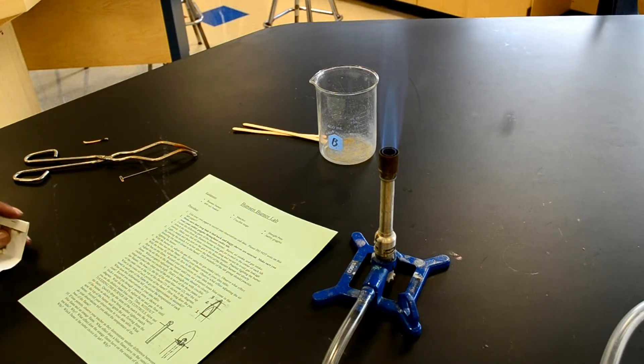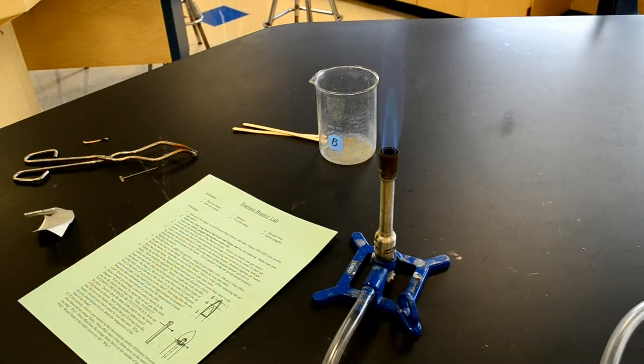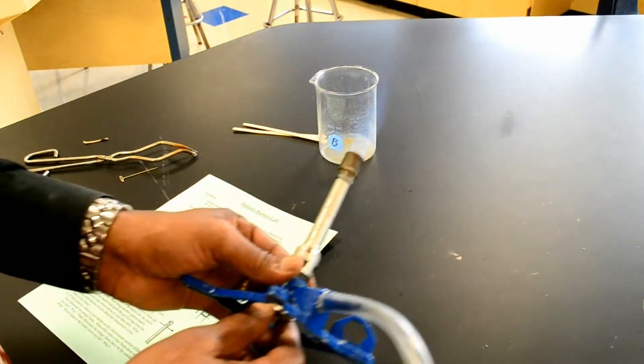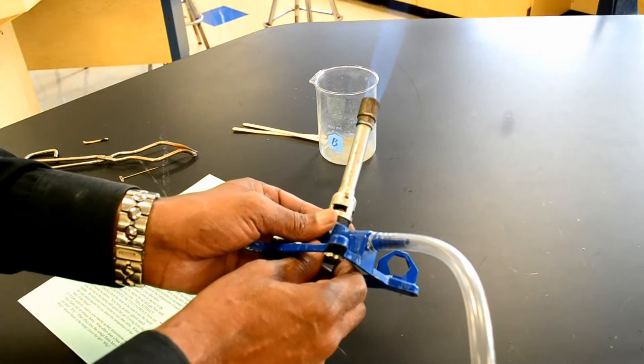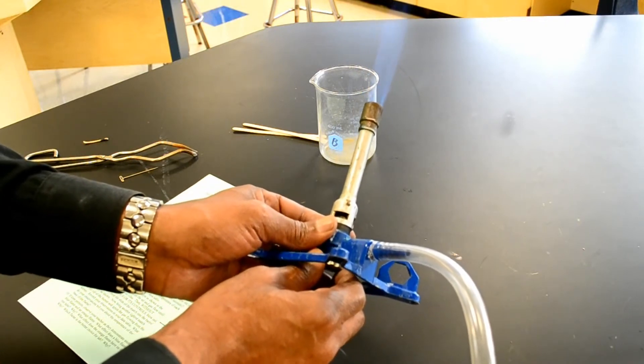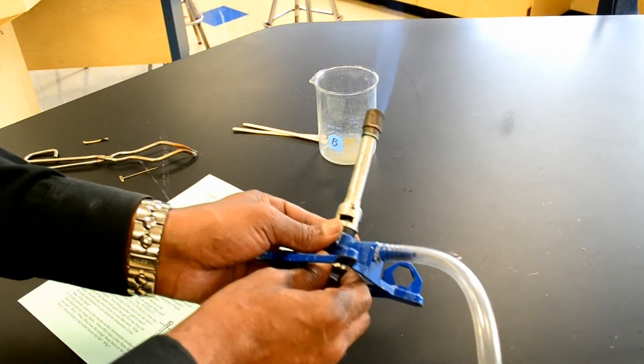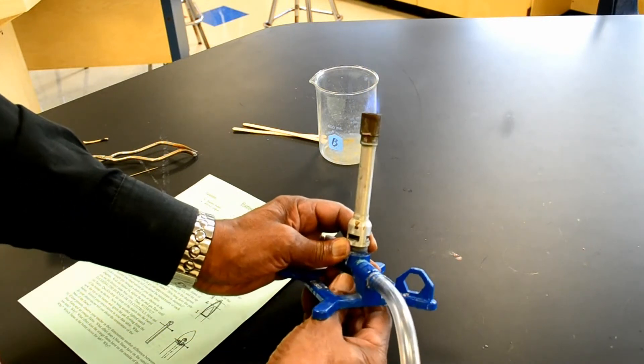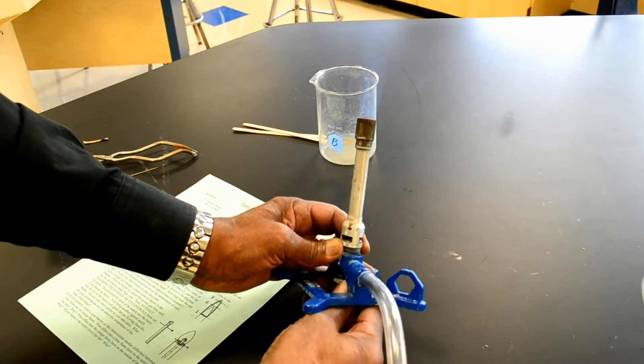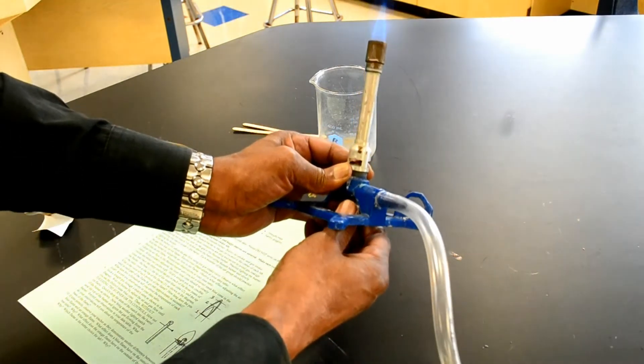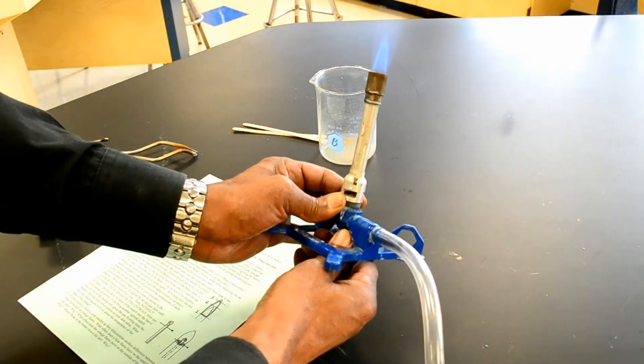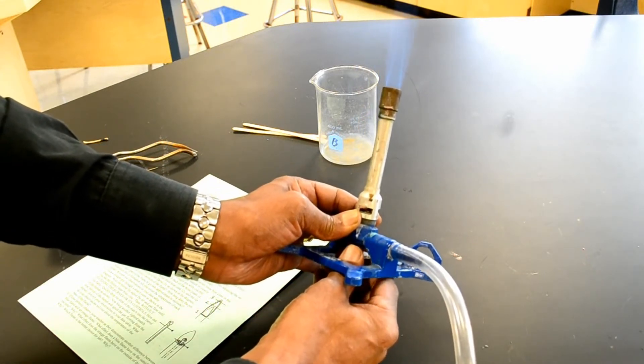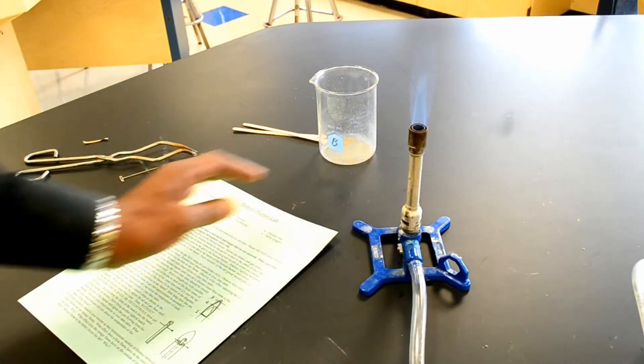Then it says, with the burner lit, adjust the gas flow using the gas intake valve. Now the gas intake valve is on the bottom. It's called the spud. Observe the effect the gas flow has on the flame. Making it really tight, you see the flame will go smaller, or the flame will go up. As I tighten the valve, the flame gets smaller. As I loosen the valve, the flame gets taller.